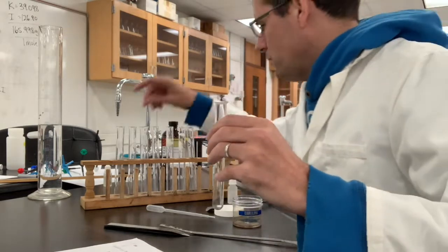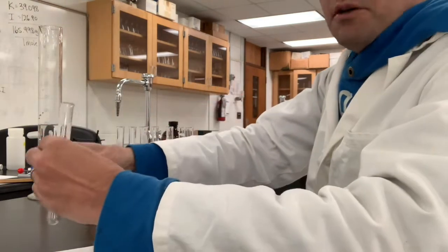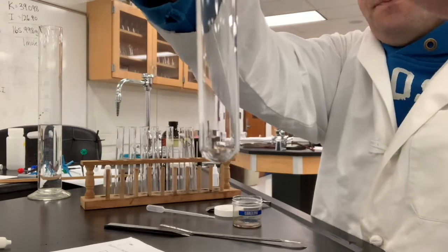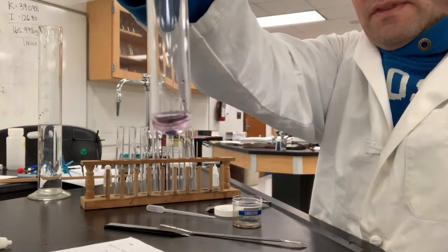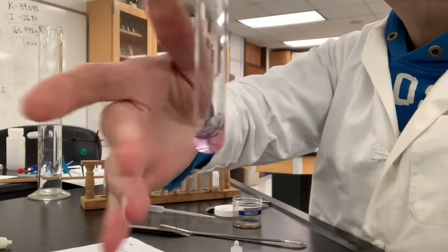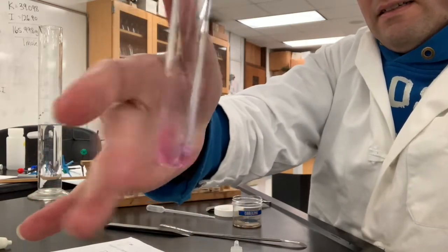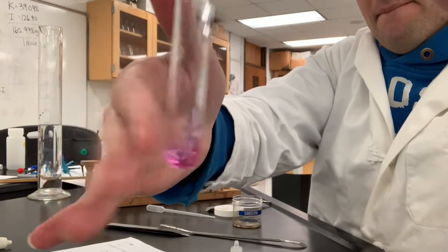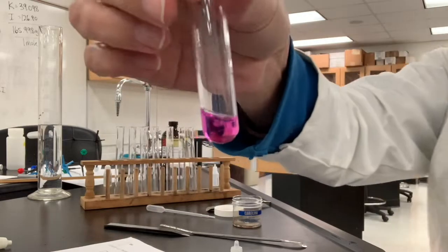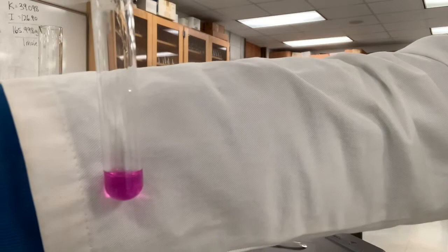Now we'll add water. Here's the water dropper, and we'll see if this dissolves. Go ahead and make your observation — whether you think that's soluble or not.